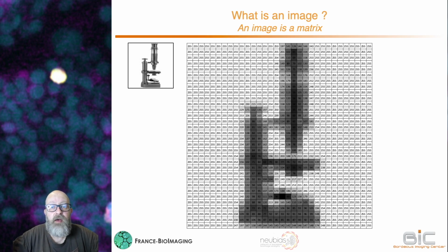contains a value, an intensity. So if the intensity is high, then this is rather light tones, as compared to here dark tones that you may have on the center of the microscope, which are usually lower values. But the question might be, which value are we picking?